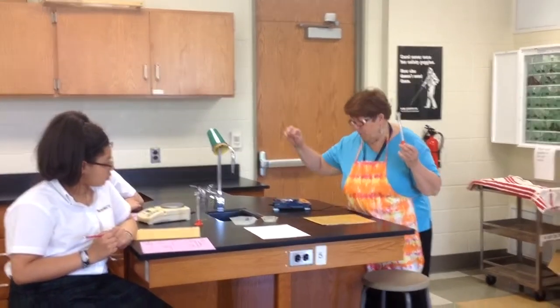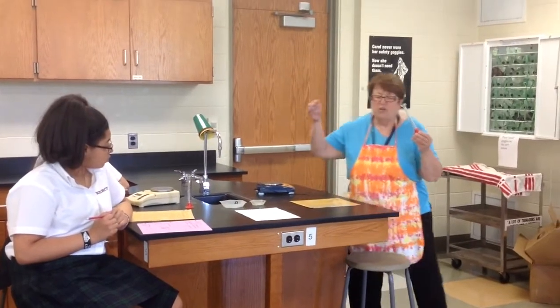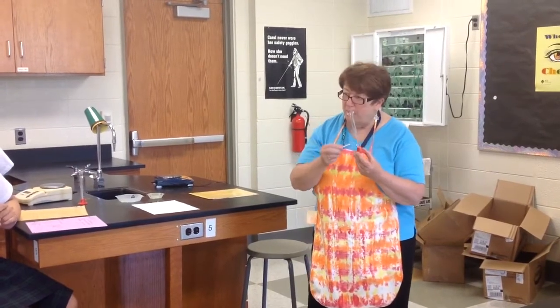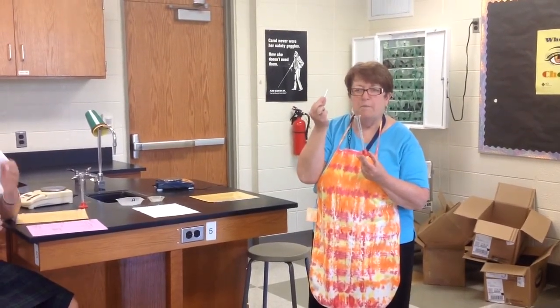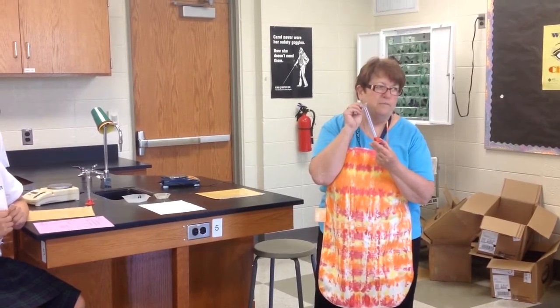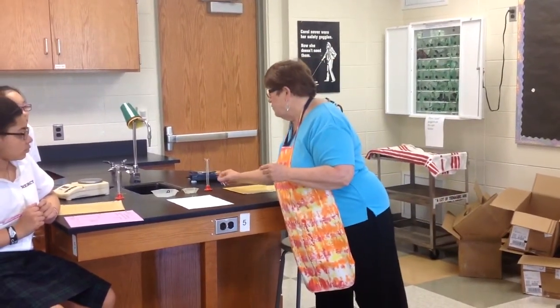Then take your metal. You're going to measure the mass of your metal. You're going to carefully immerse your metal into the water in the cylinder. Now, you don't just throw it in there. Slide it down the side. What's going to happen to the water level? It's going to go up. It will rise, right? By a certain amount, that's called displacement, water displacement. The amount that it goes up is the volume of your metal. So you're finding the volume of your metal by how much water it displaces. So you write down the volume before you put the metal in and the volume after you put the metal in. And the difference is the volume of your metal.